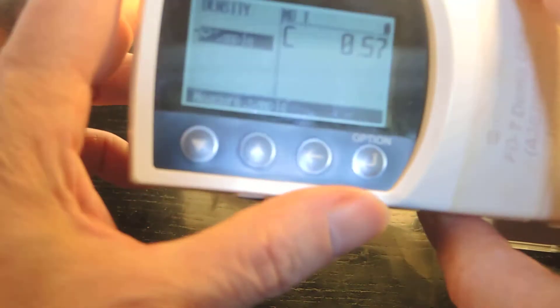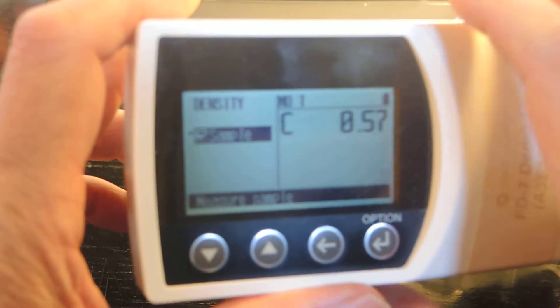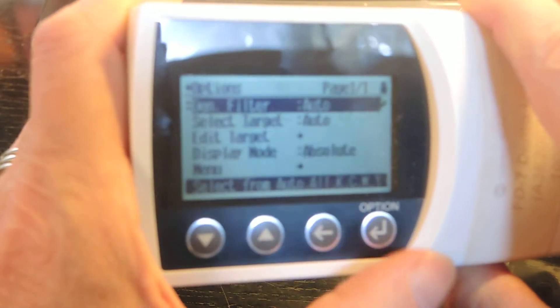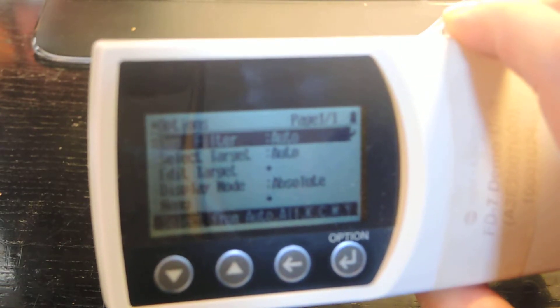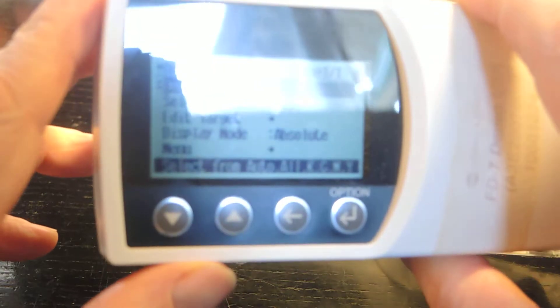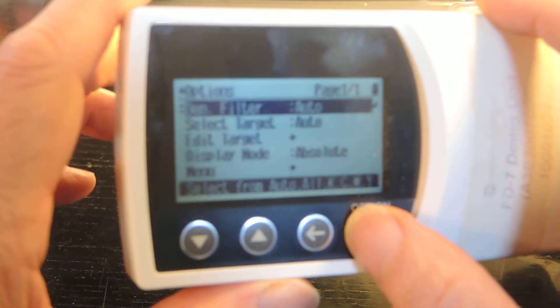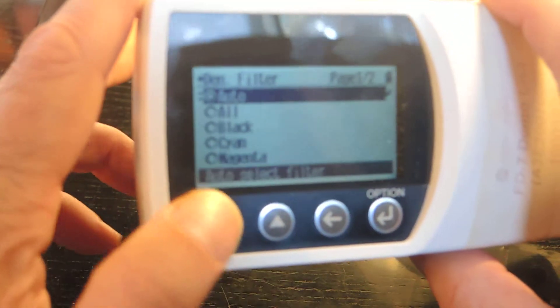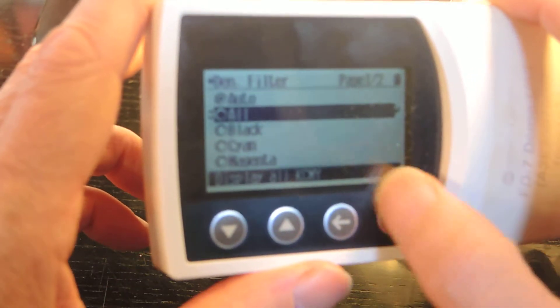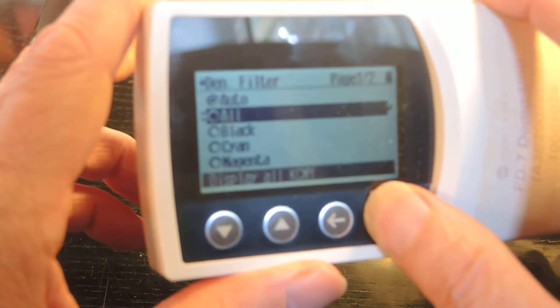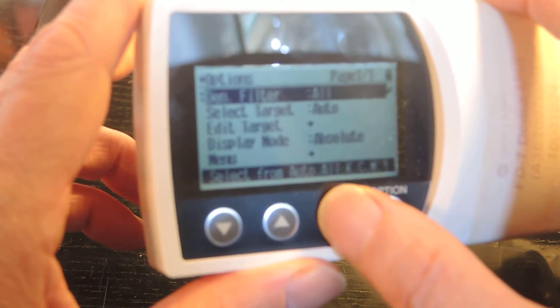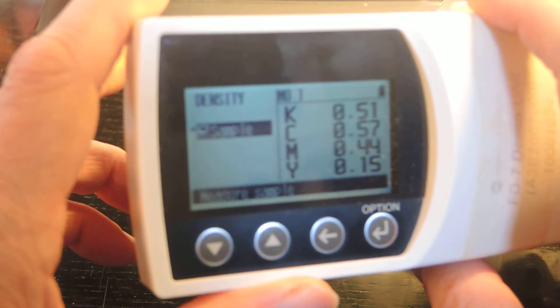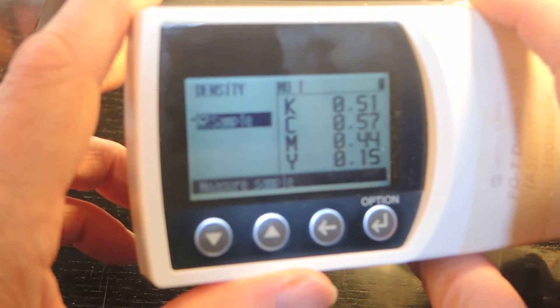Let's see if I change it mode. If I bring it up, I have to put on my glasses because I can't see anymore. I'm getting too old. And it says density filter auto. So if I press the friendly enter button over here, I bet I can have all these extra choices. So go to all, for instance, press enter and go back here to the measurement. And sure enough, there's all the density readings for this mode.